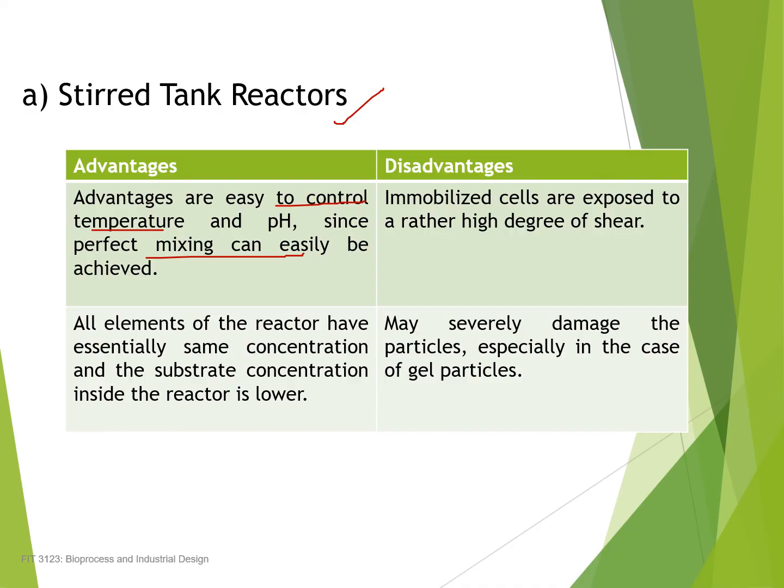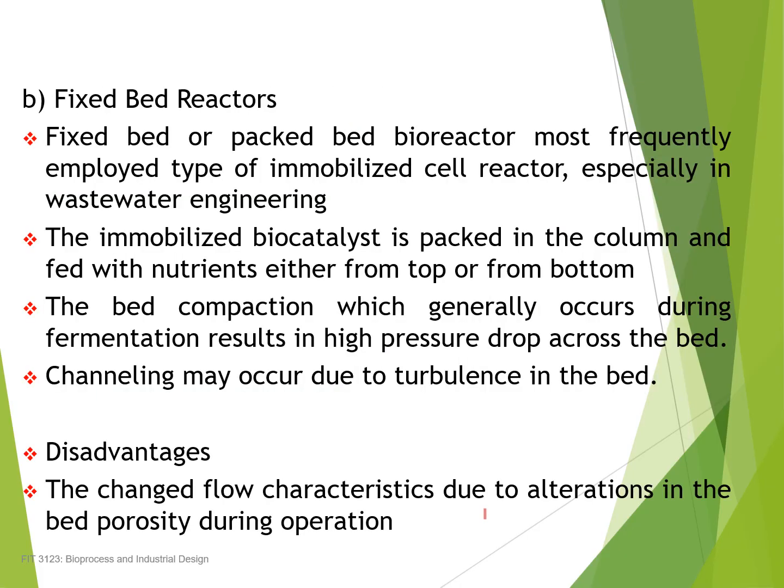Okay, but then the disadvantages: immobilized cell might be exposed to a high degree of shear. So when it is too exposed to shear, because of the shear stress, the cell might be ruptured or damaged. Okay, fixed bed means you fix the bed or you pack it.